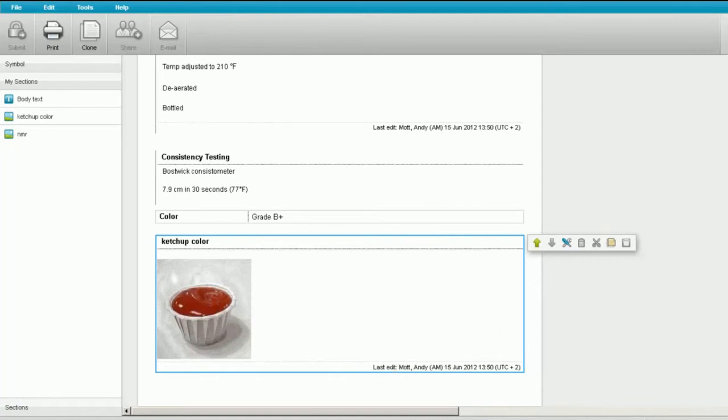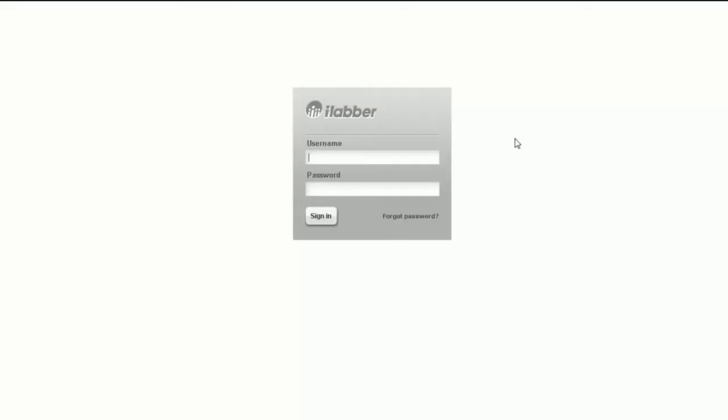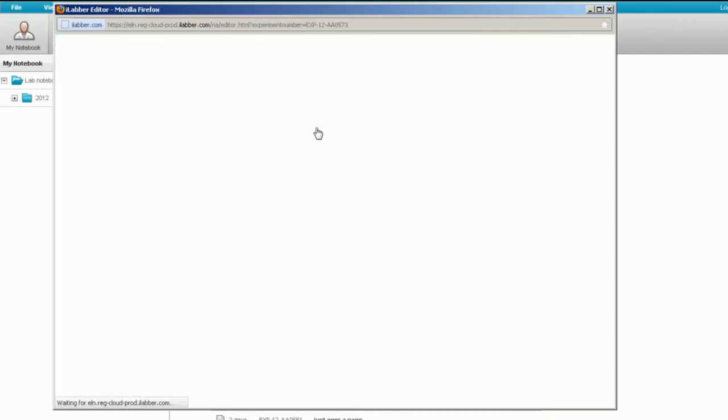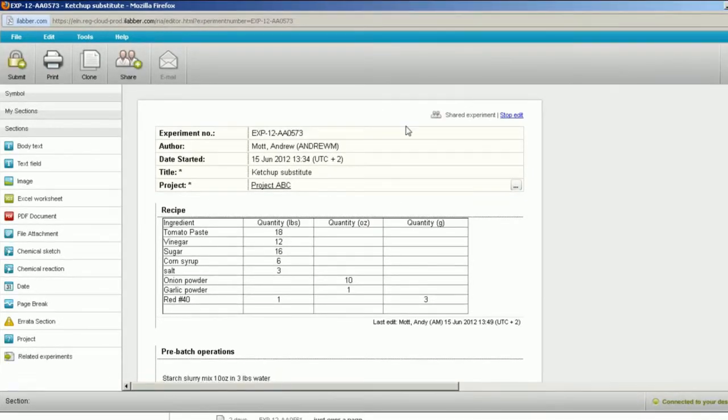Okay, if I go back in and log in as the author of the experiment, open up the experiment again. So now I'm back in as the author.